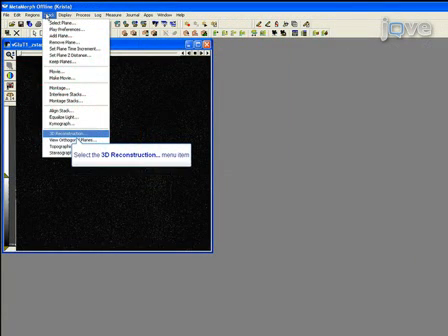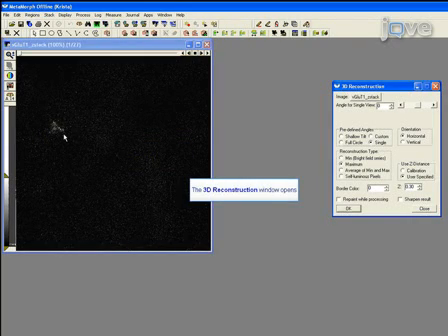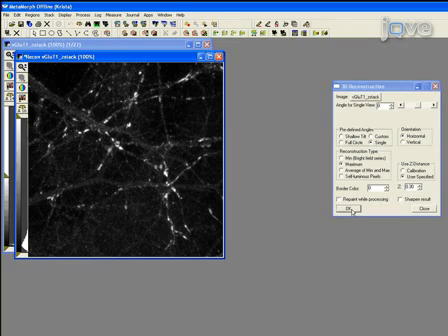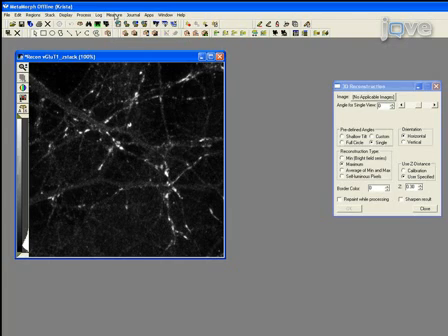To analyze images after acquisition, use analysis software to convert the Z-stack into a composite single-plane image based on the maximum intensity reading from any plane at each pixel. Set threshold to reduce background.